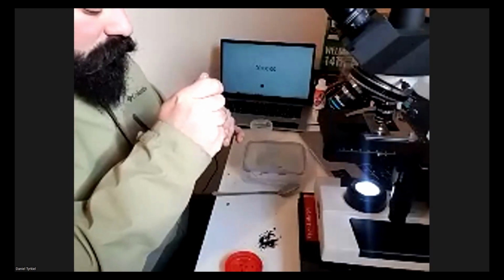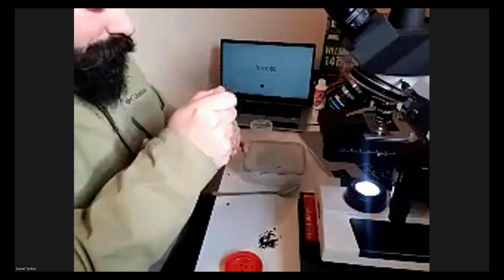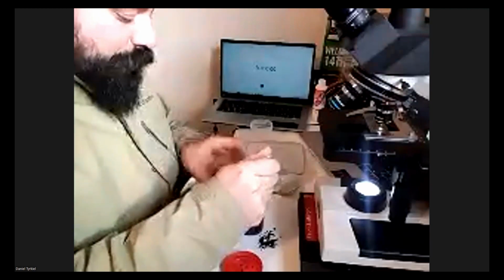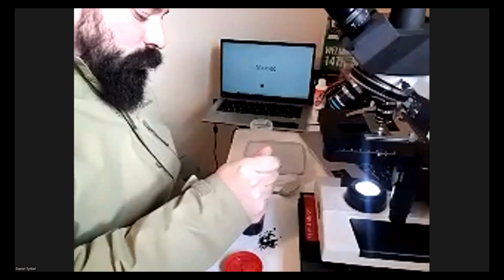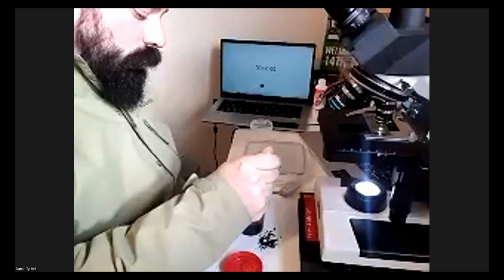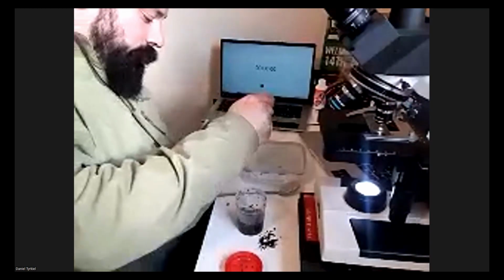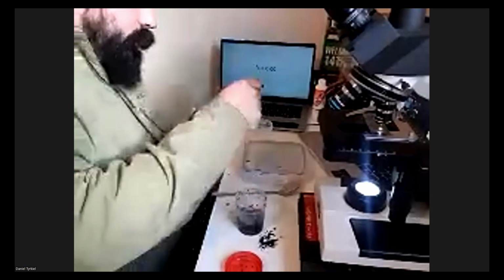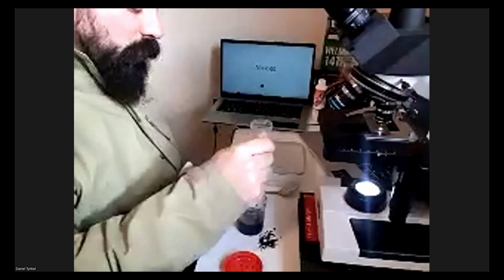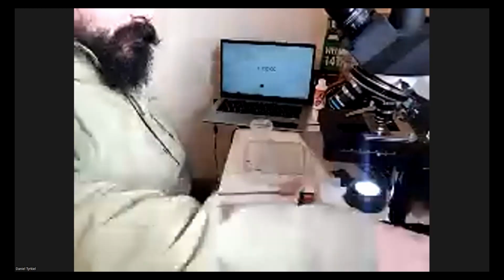It's great to standardize the amount of time from the first mix to when you take the sample. So I've vertically dropped a single drop from the pipette, and we'll learn to calibrate the pipettes if we have time.